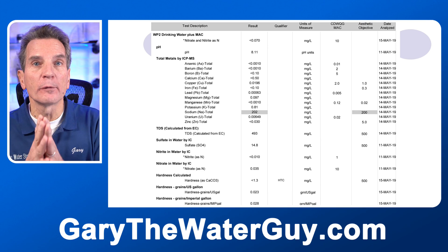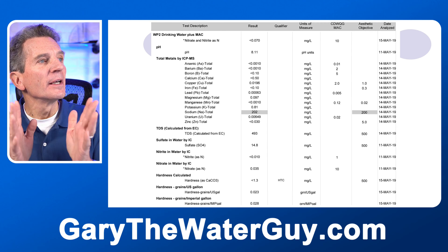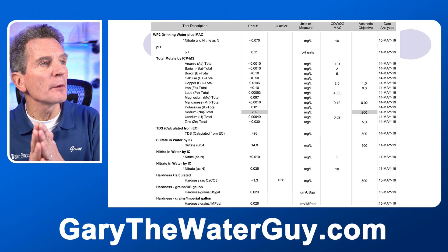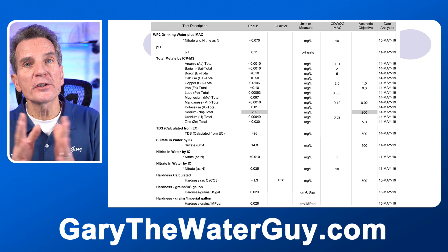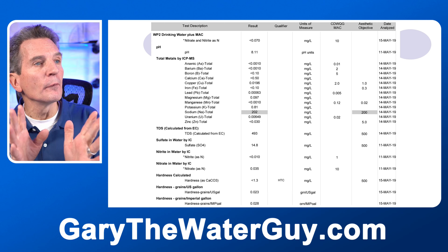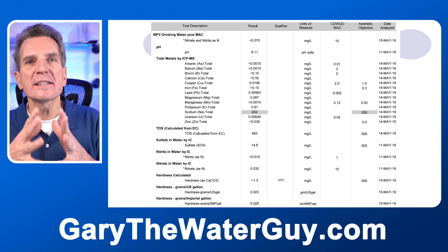Here's a good example of what you might get from a licensed lab. Definitely check the headings across the top: the result, which is the test results from your sample; units of measure, which we'll talk about in a second; MAC; aesthetic objective; and date analyzed. Let's delve a little bit deeper into each one of those headings.